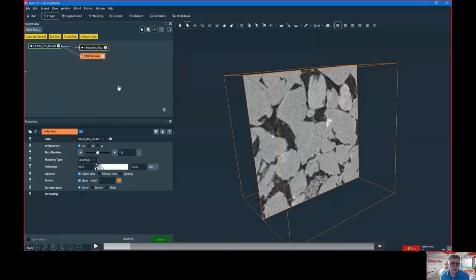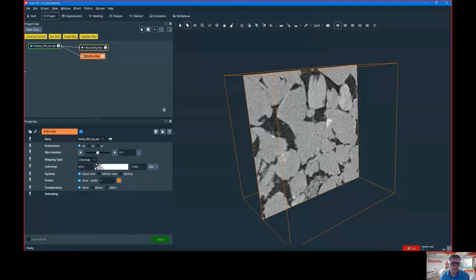So it's a good habit that during your work you save, and you may save different steps in different projects. So what is this HX file? It's a file that will allow me to come back exactly to this condition. So if I get lost tomorrow, I can reload this file.